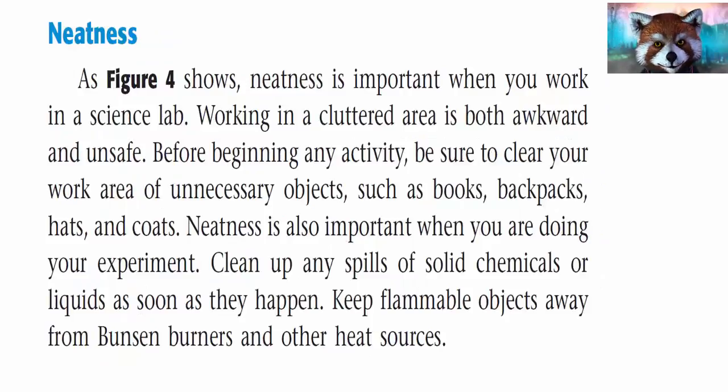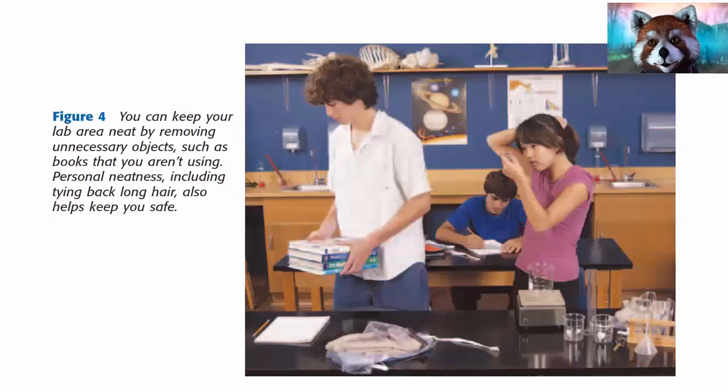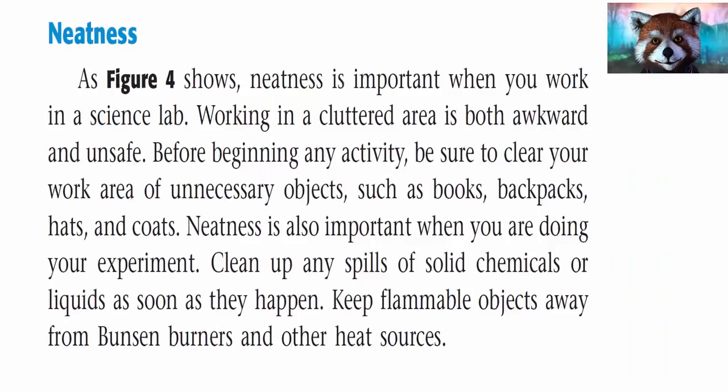Neatness. As Figure 4 shows, neatness is important when you work in a science lab. Working in a cluttered area is both awkward and unsafe. Before beginning any activity, be sure to clear your work area of unnecessary objects, such as books, backpacks, hats, and coats.